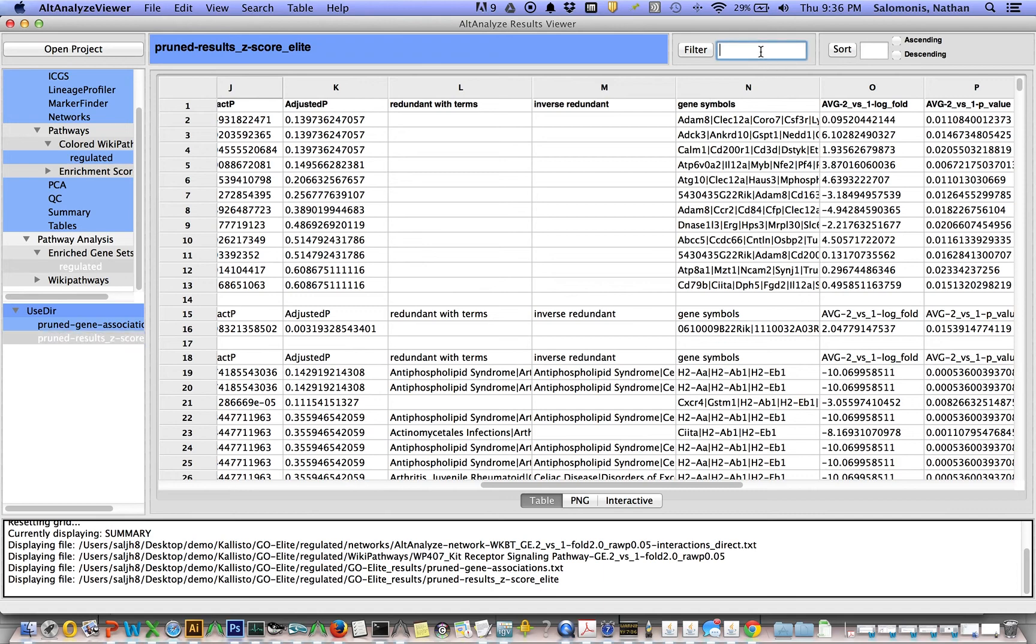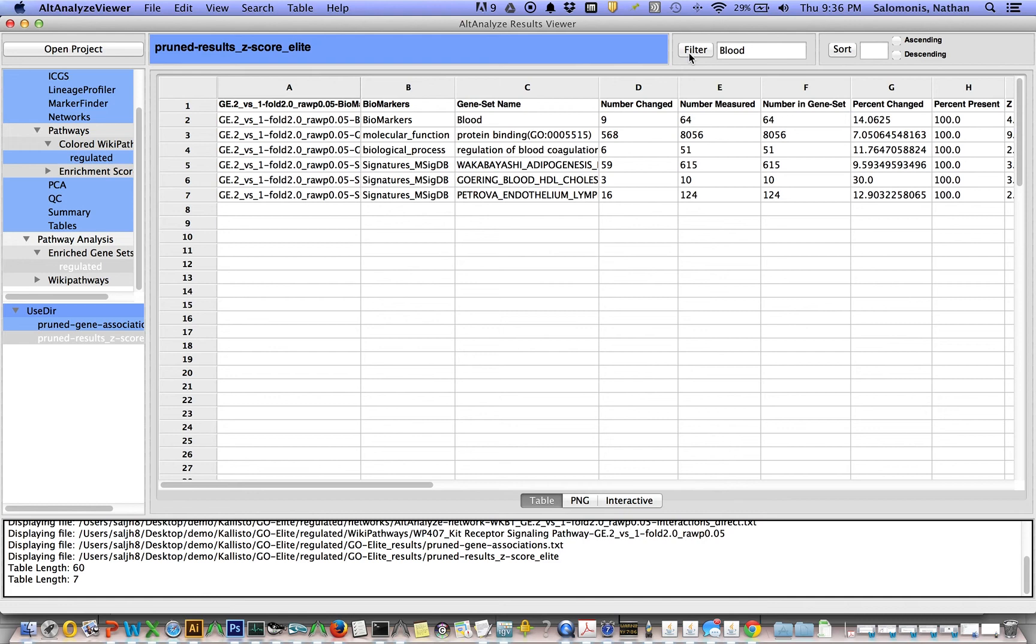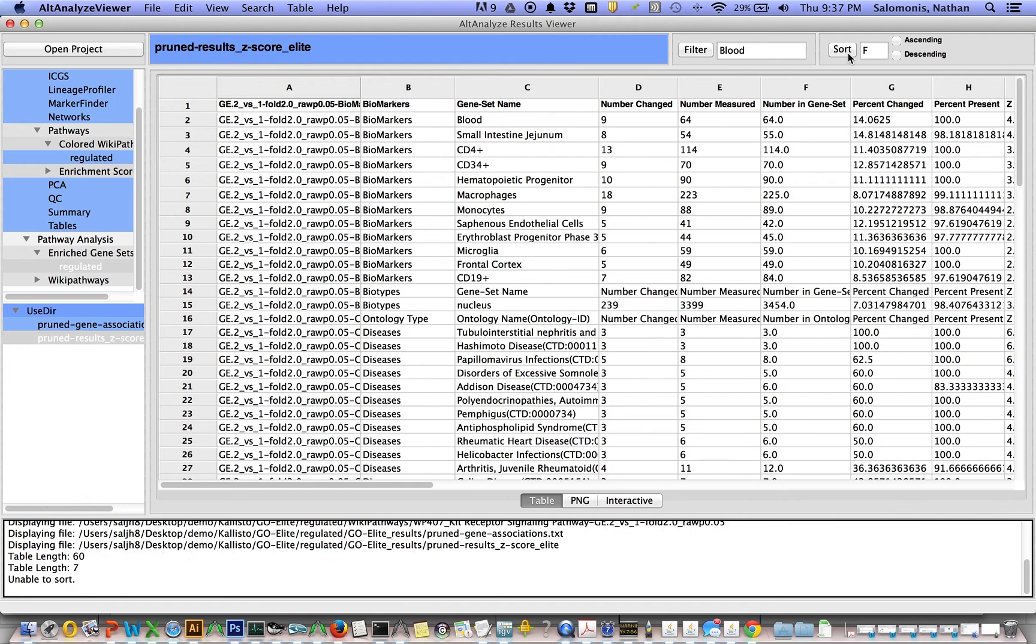You can actually filter these results by selecting a gene or some other criterion. Or you can sort these tables based on their column.